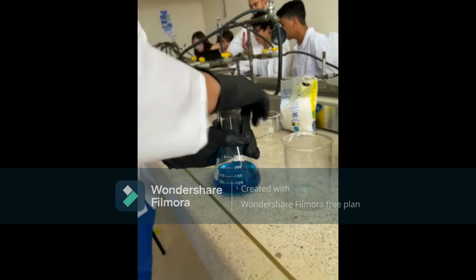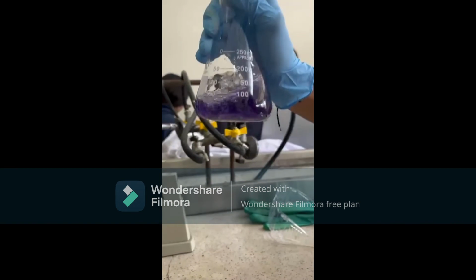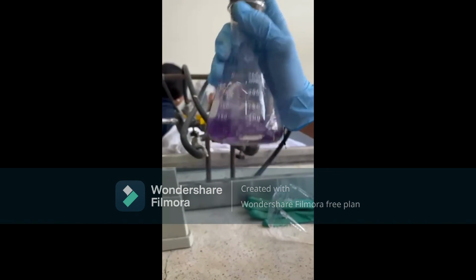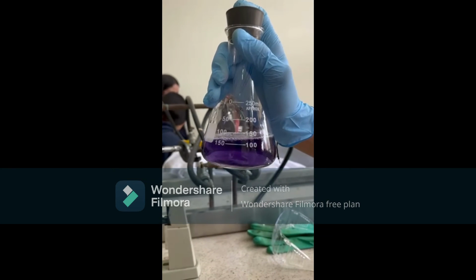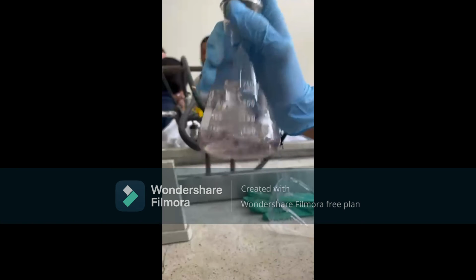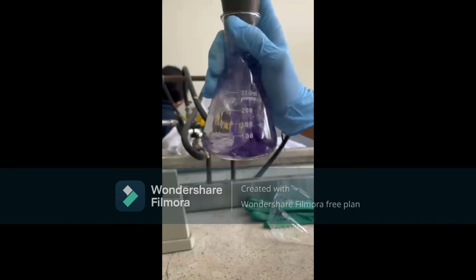And last, after 10 tries, the color was not blue anymore, but purple, and not a light purple, it was the opposite, a dark purple. I also forgot to mention that the time to pass from the methylene blue, which in this case wasn't methylene blue anymore, to the transparent state was more than a minute. And every time we shook it and took the time, it was getting longer and longer.